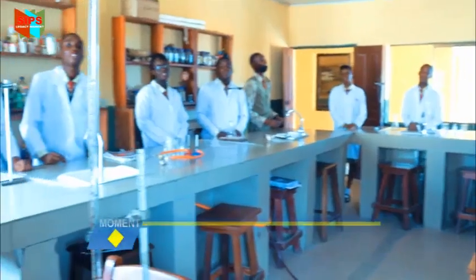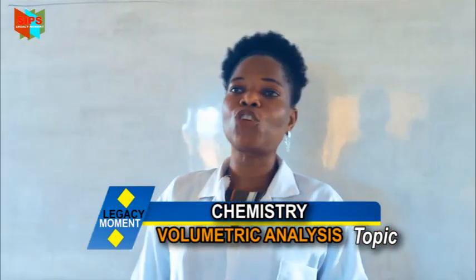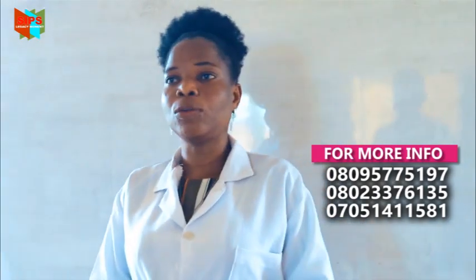Please join us. Good day, students. Good day, ma'am. Our topic today is volumetric analysis. Volumetric analysis is also known as quantitative analysis. It involves the measurement of the volume of acid and base by means of chemical reaction, involving the measurement of the volume of the acid and the base to be used.